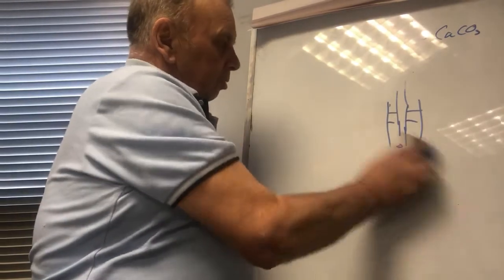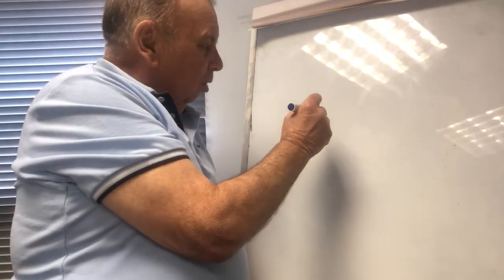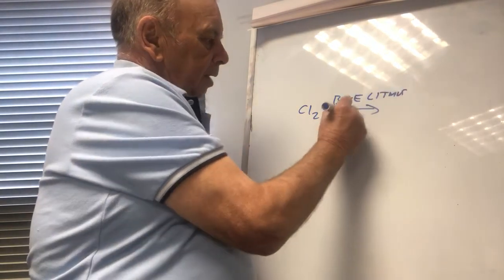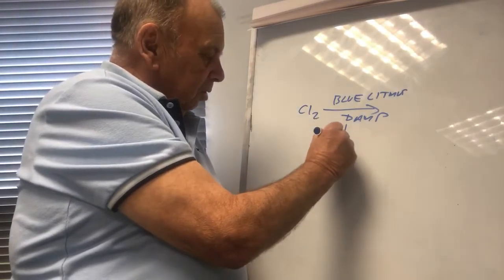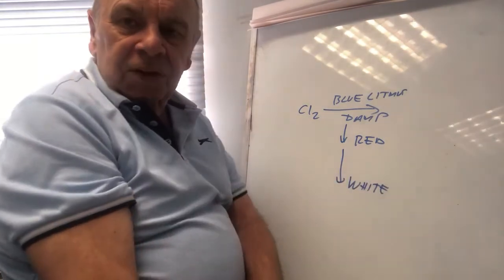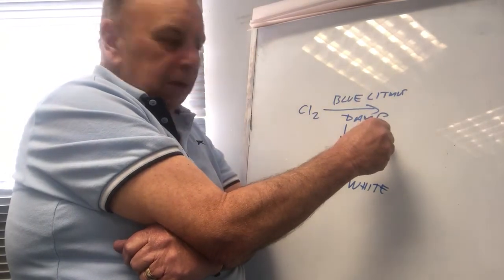And the final gas you need to know about is chlorine. Chlorine gas. Okay, there's the chlorine gas. If I pass it over blue litmus paper, blue litmus that's damp, first of all it turns it red, and then if I continue doing it, it bleaches it white. So a test for chlorine gas: pass it over damp blue litmus. It turns it red first, then it turns it white.